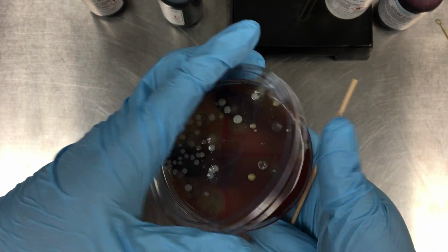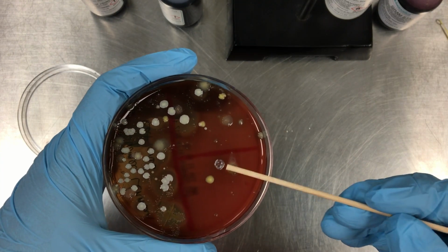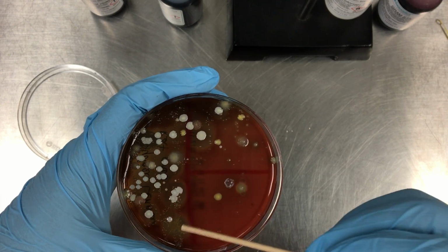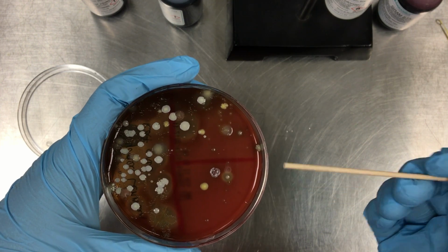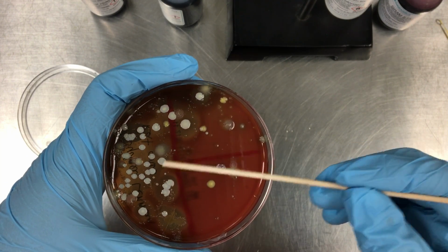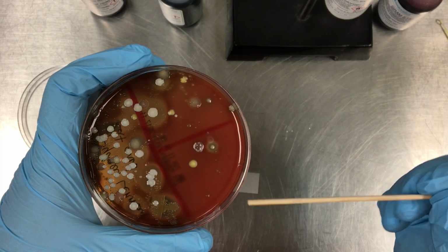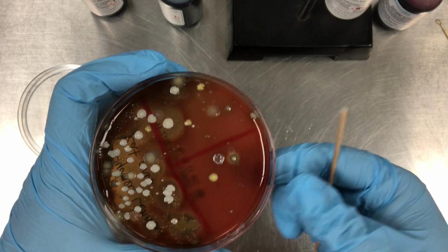And colony selection on the Petri dish should be done based on which bacteria looks like it's predominant. Which one do you see the most of? That is most likely the bacteria that's causing the issue, the problem, or the infection. And you also need to make sure that the colony that you retrieve your sample from is isolated from the other one so that you don't accidentally pick up two kinds of bacteria.